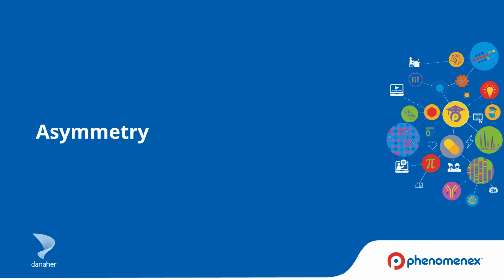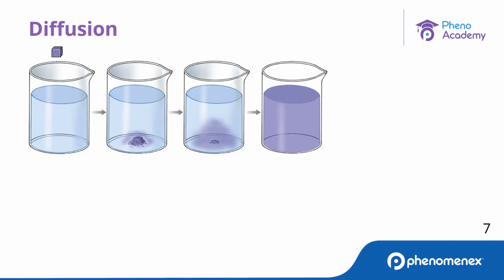The first of the 4 that we're going to cover is asymmetry. And I can't really cover asymmetry before going over diffusion. Here you see a purple sugar cube that is being dropped into water. Now, as you know, the sugar cube dissolves in water and the sugar molecules diffuse over the available volume until they are more or less equally distributed.